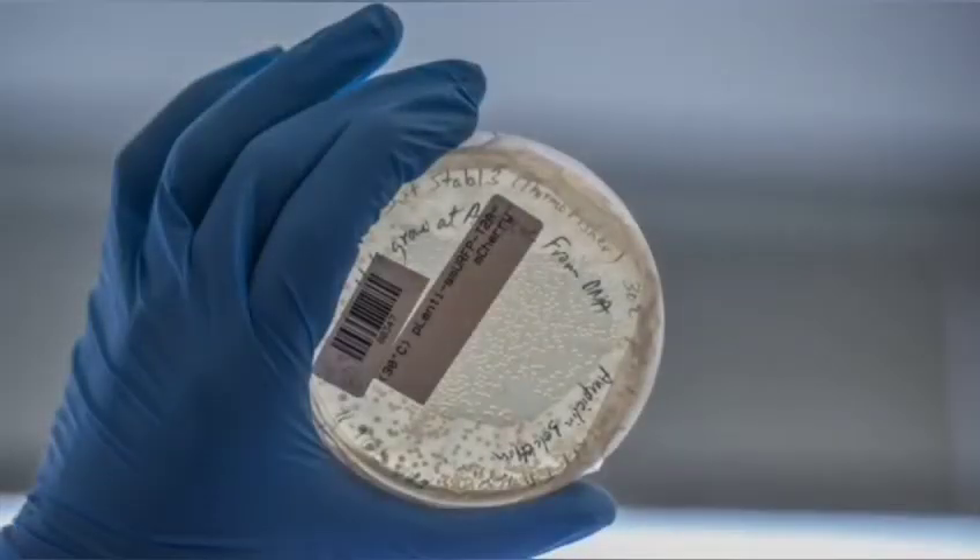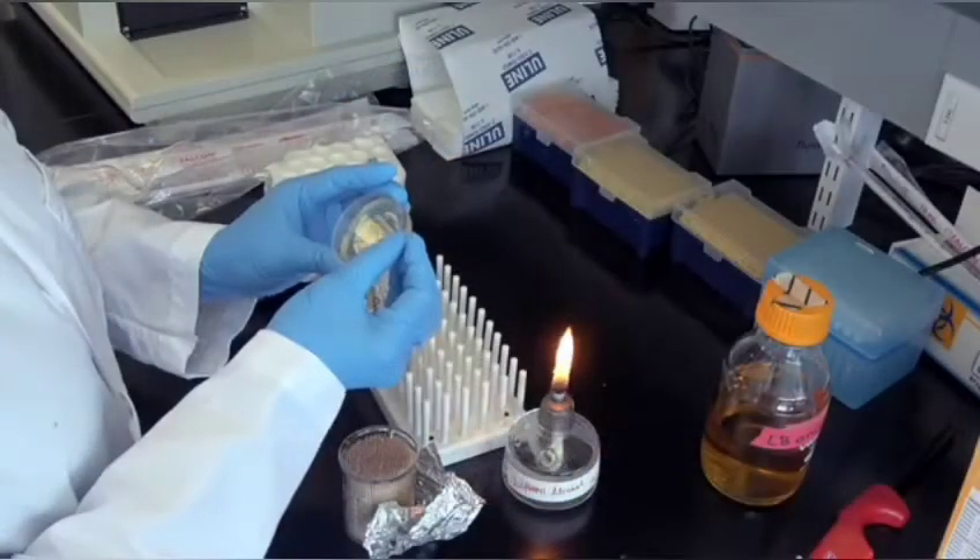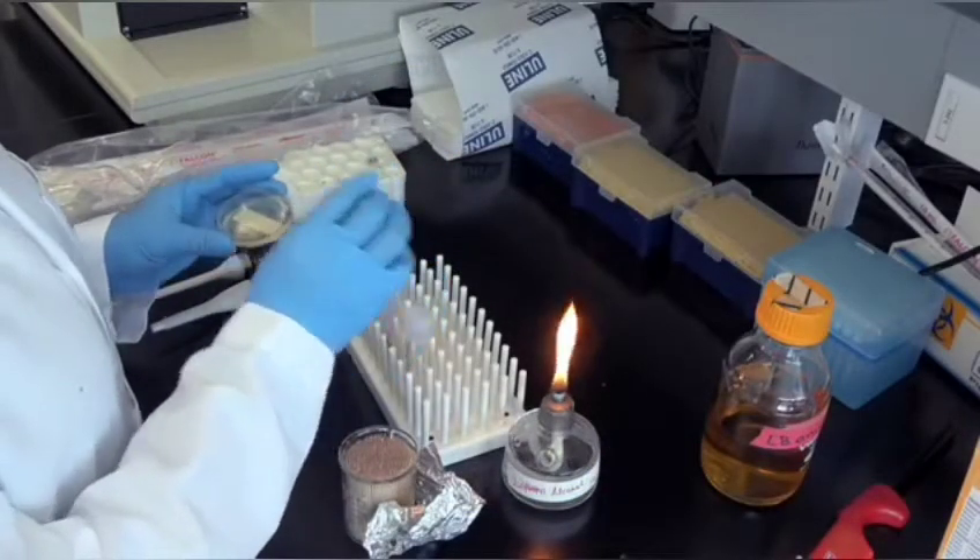By starting a small liquid culture from a single colony, you can ensure that the liquid culture contains a monoclonal population of cells.